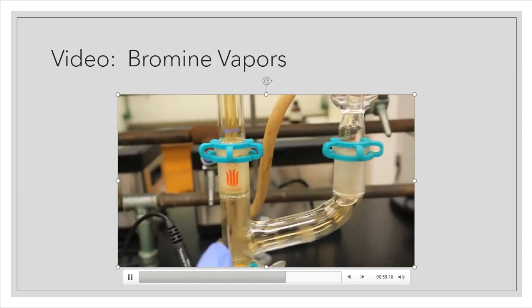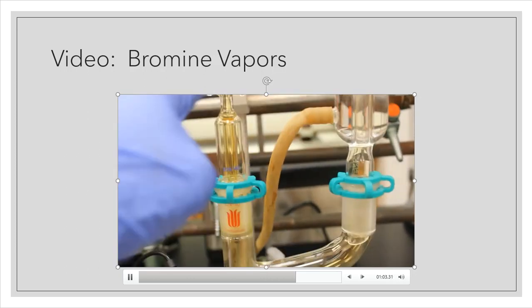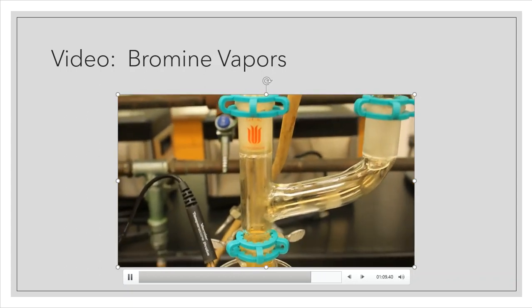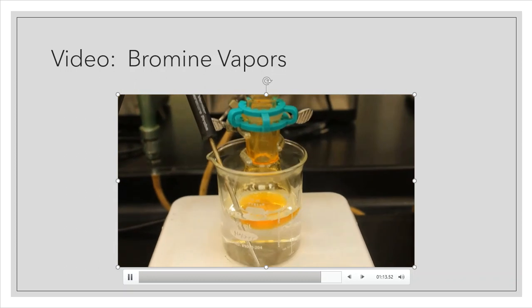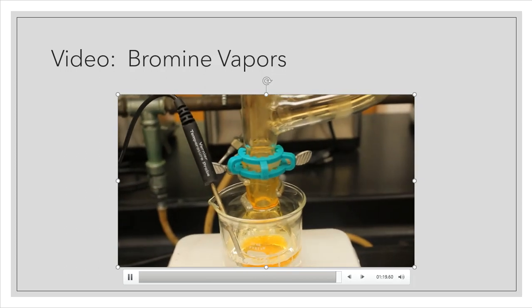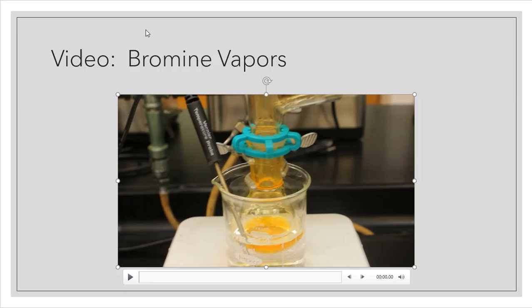That's also the purpose of this Claisen as well. It makes me a very good joint, so that way I can add my bromine through the separatory funnel, and then the reflux can keep that bromine in this vicinity, at least. All right, so it looks like my solution has gone to a very light orange color again, and I'm getting ready to add my next portion of bromine.